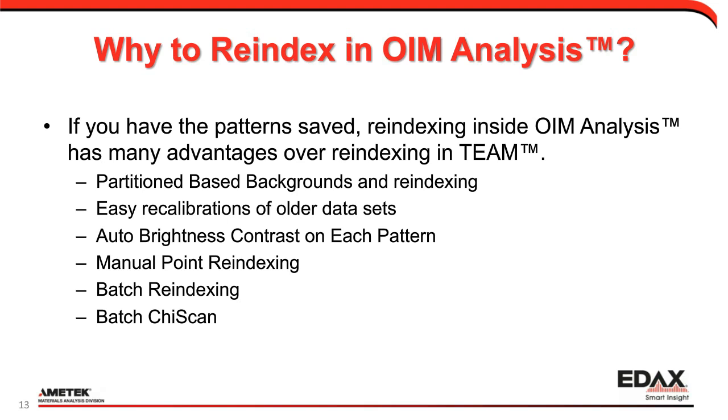Back in the day, if I had a real difficult geological material, it could take me 3 or 4 days just to get decent patterns consistently out of something. Now with these tools, I can often take those data sets on the first run and say, okay, I have all the information I need, and just go ahead with that.